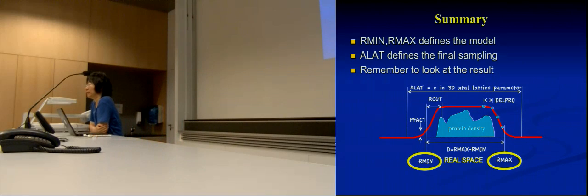Questions? So I think for us it would be great if you could just sit down with us and look at a few projects and look at how we fit the lattice lines.